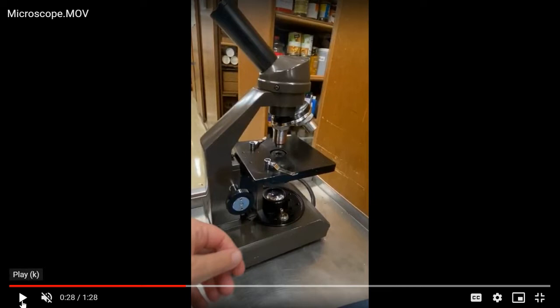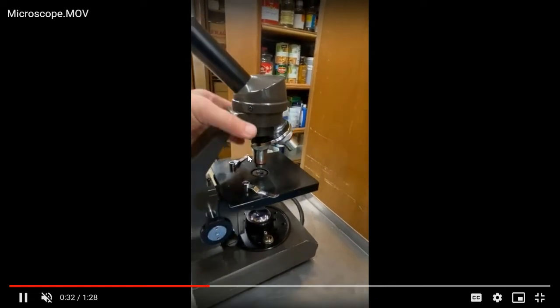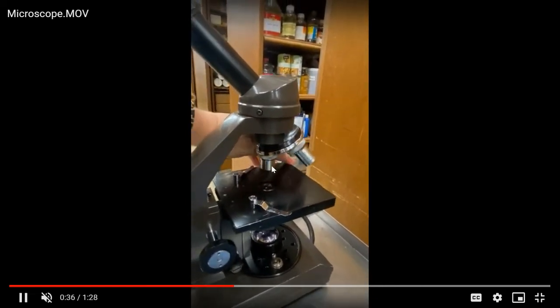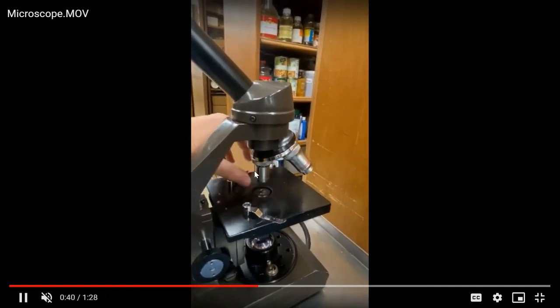This specific compound light microscope has what we call these stage clips, and it has three different objective lenses. It has low power, which is the shortest, medium power, which is a little bit stronger, and then the high power objective lens.